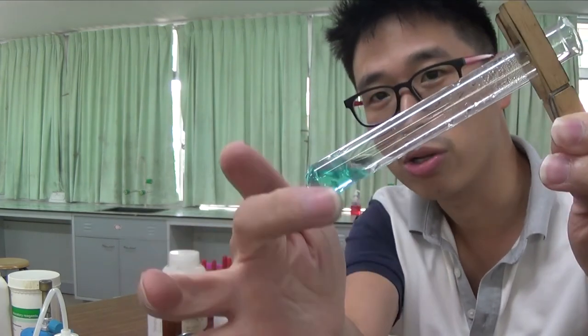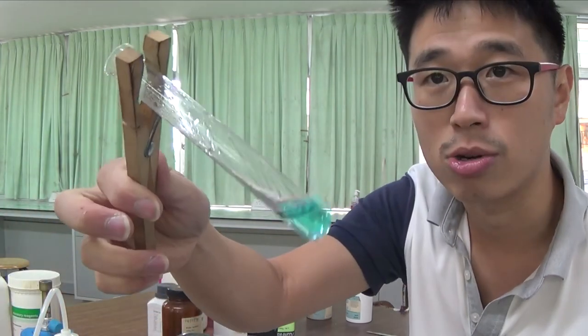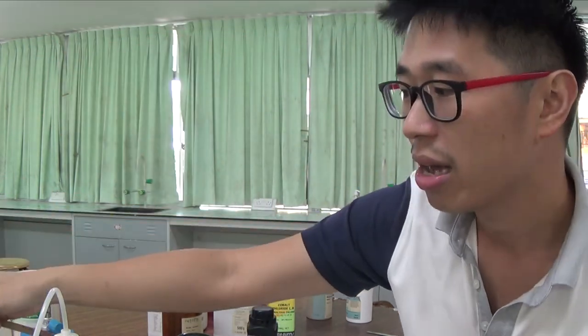The fact that you get a blue solution again refers to this idea of reversible reactions. In the presence of water, the anhydrous copper(II) sulfate gets surrounded by water molecules again, and they reform that hydrated compound, which you can then purify by crystallization, and you can get the hydrated crystals where the water as the solvent can co-crystallize, meaning they crystallize together with the giant ionic structure of copper(II) sulfate.